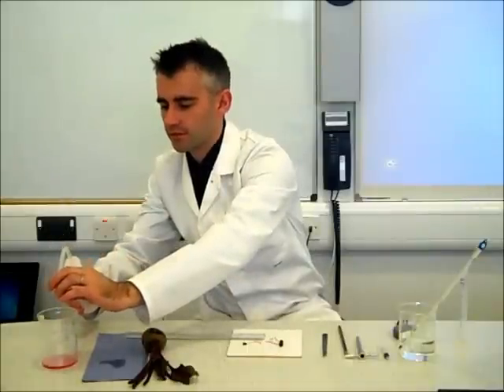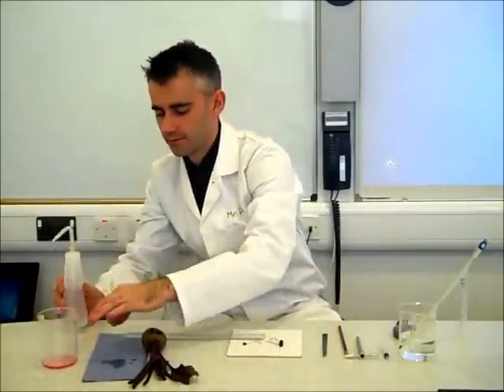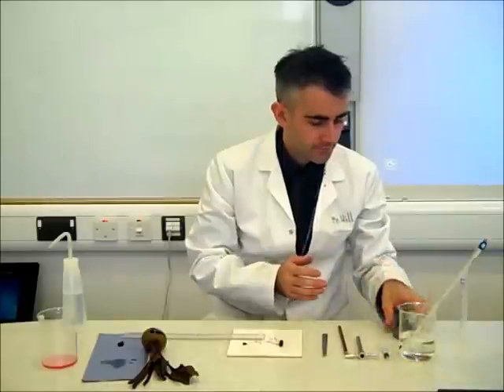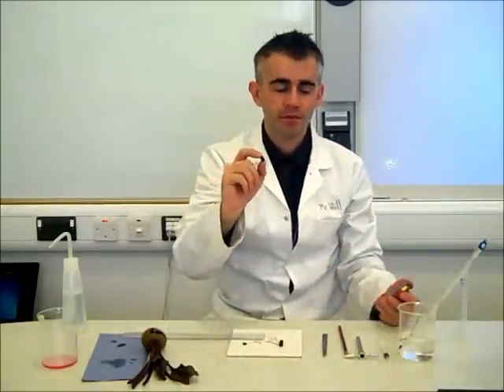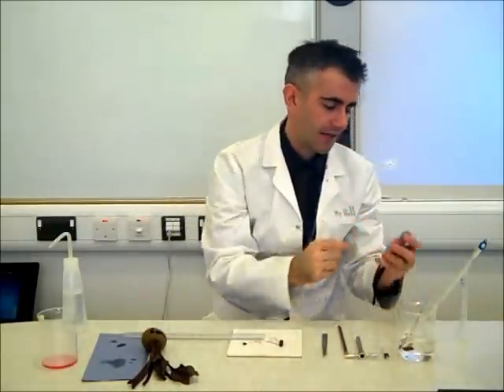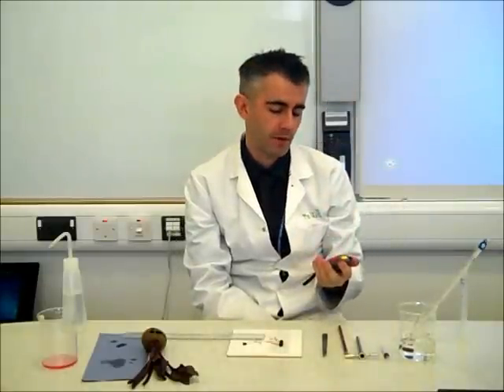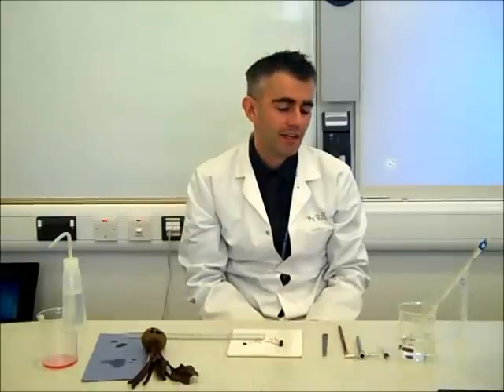I'll give the beetroot one more rinse before I start. I'm now going to place my beetroot sample into the boiling tube and start the stopwatch to time how long it's been in there. I'm going to leave each beetroot section for the same length of time — 20 minutes at each temperature. Ideally I would do three different samples at each temperature so I can make my results more reliable and take an average for a more reliable figure of cell membrane permeability.